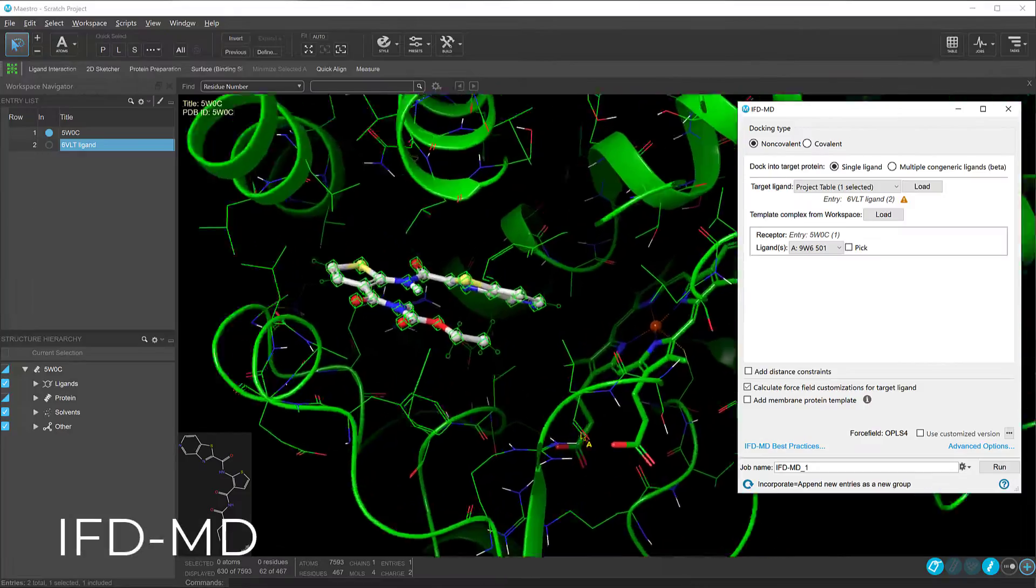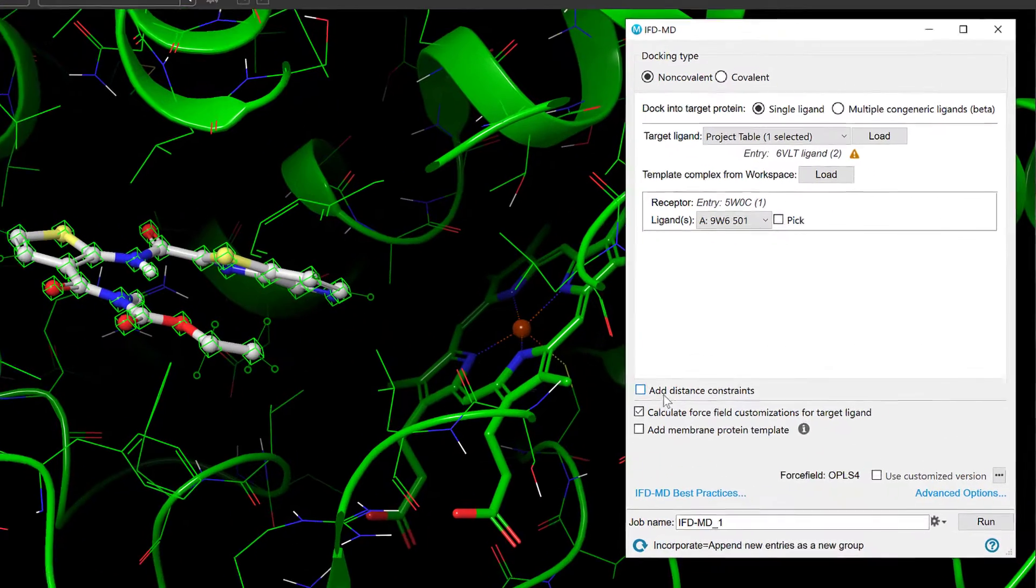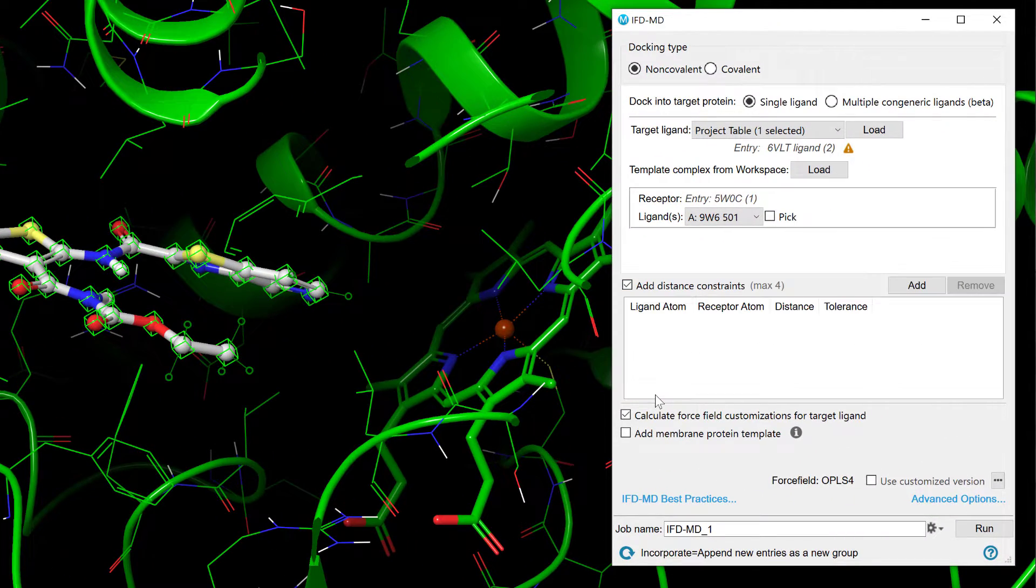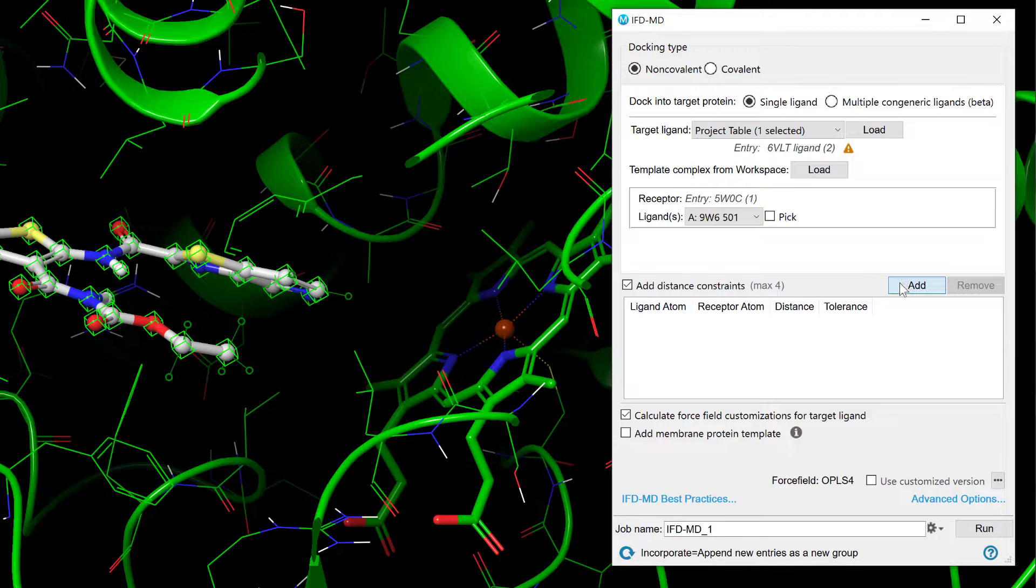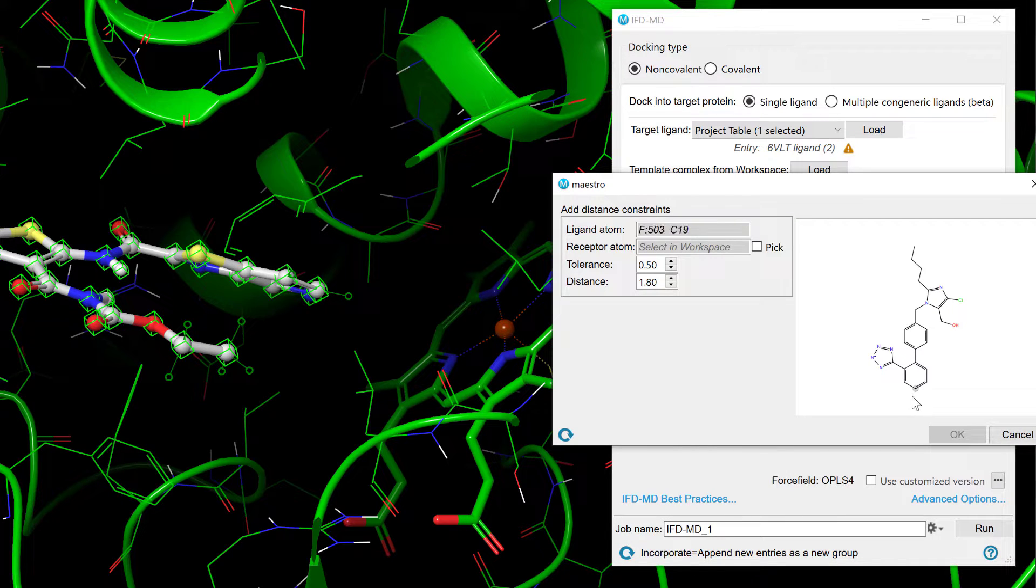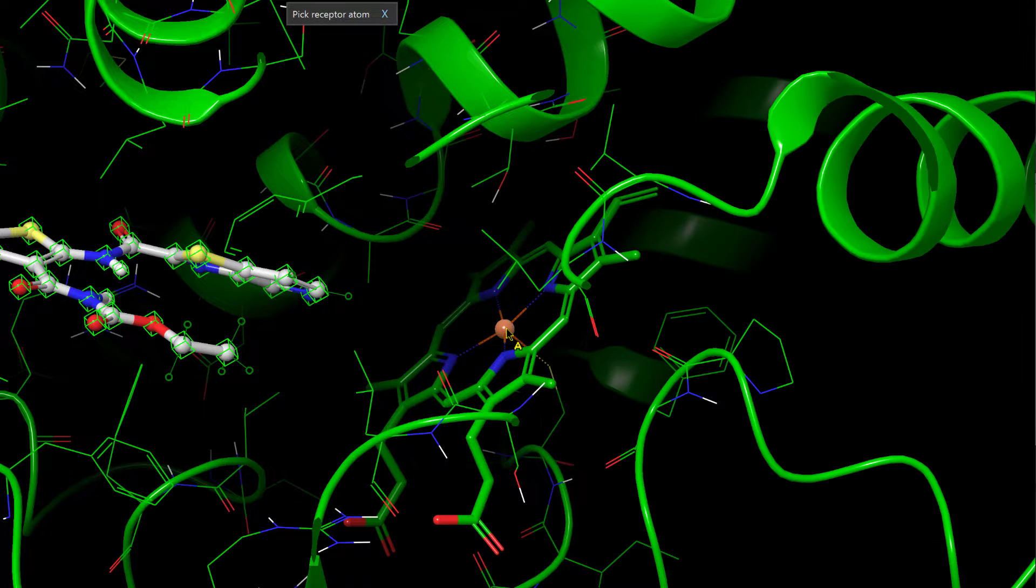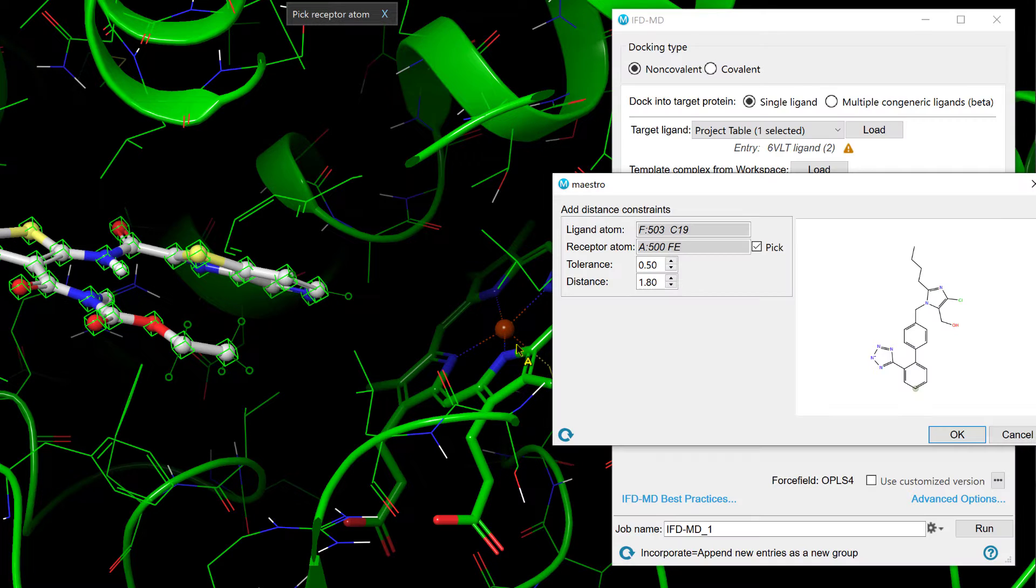Over in IFD-MD, it's now possible to apply pairwise distance constraints between the target ligand and the receptor. Simply specify the ligand atom in the 2D image and the receptor atom in the workspace, and then set the distance and tolerance.